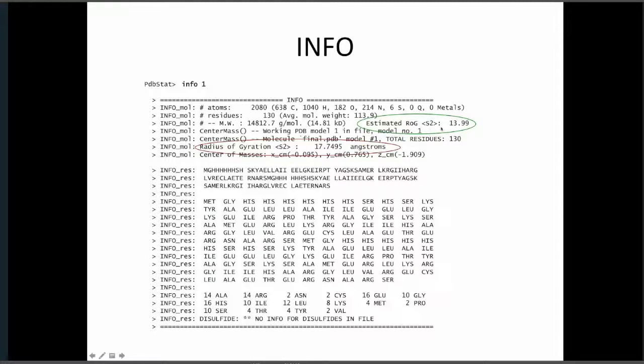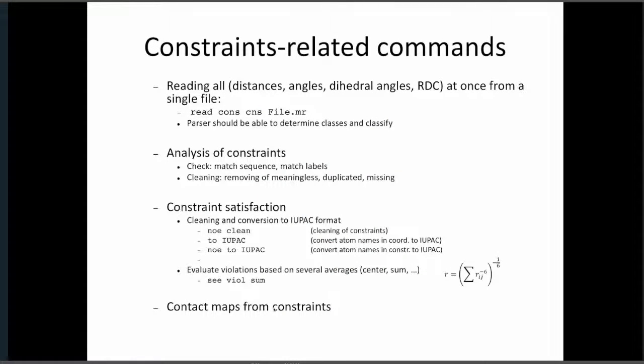As you see, they are usually different, and that is the reason it's used for some of the structural refinement. It will also provide you the sequence and the number of every residue, the different numbers. Well, that is regarding the coordinates.